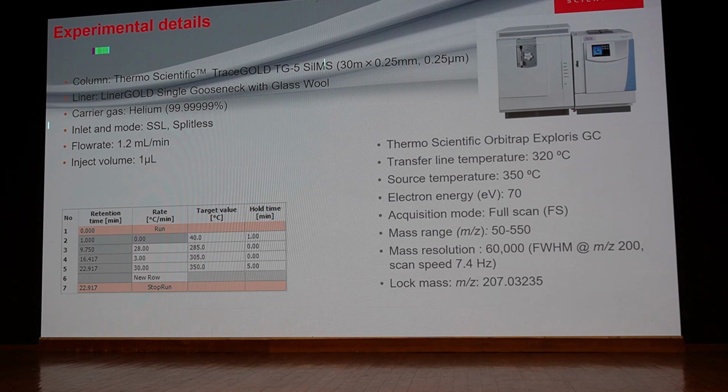So you are extracting a lot of background noise in the case of triple quad or single quad, whereas you are filtering out that background noise when you put a 5 ppm mass extraction window, so that you get a clear-cut signal, a clear-cut picture of that particular peak, and very limited or negligible noise. That is the difference, so the purity of that signal is at a much higher level, and that's why you can easily achieve a mass error below 5 ppm.